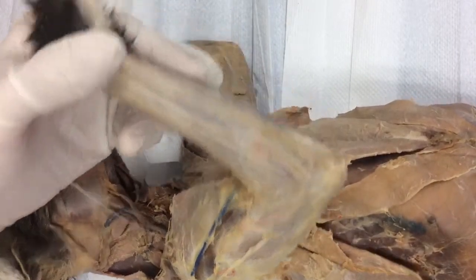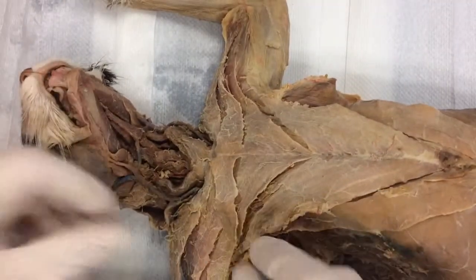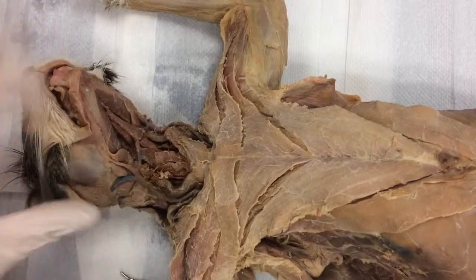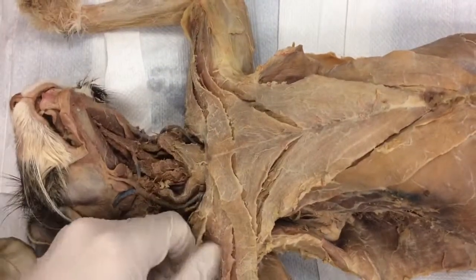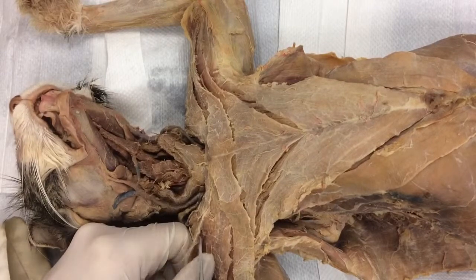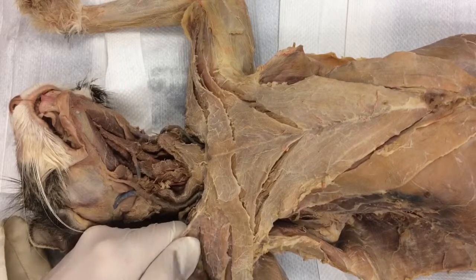So I'm going to flip it back this way. This is where everybody quits, and I need you to keep going. Let me reposition this kitty cat, because this is where it gets tough. Right here it's attached to major — this is clavobrachialis, the pectoralis major.